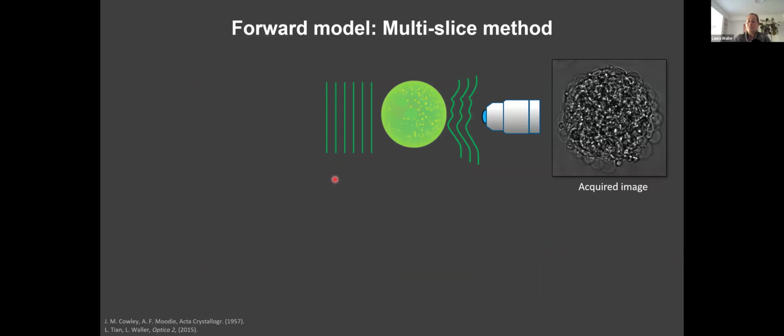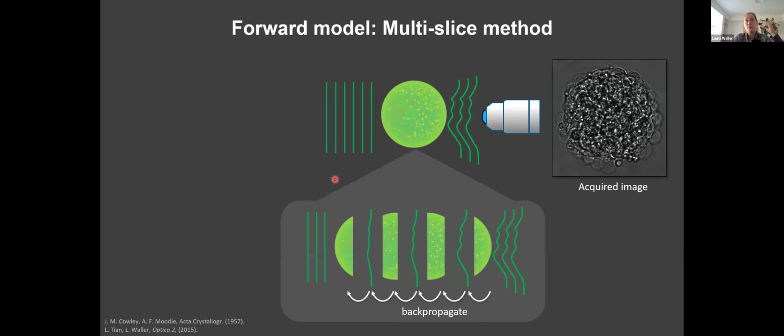And largely what people have used in the past is just single scattering models, the Born approximation. It results in a really simple 3D transfer function, which is linear in complex field. And so it's very easy to solve the inverse problem. But now we're talking about the 3D sample as if it was a series of 2D slices. Each slice has an amplitude and phase that it imposes.